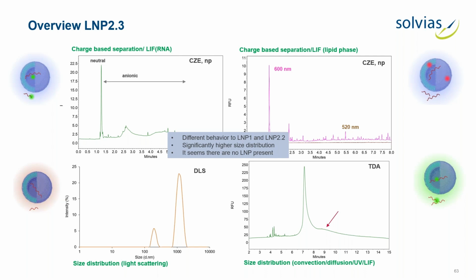So fortunately, we can have a look at the RNA level, at the molecular level. And if we only had these pictures, the world seems to be better again. Not only the encapsulation efficiency, but also the integrity of RNA looks perfect. No fragments of the RNA are present. However, cryoEM reveals the truth.